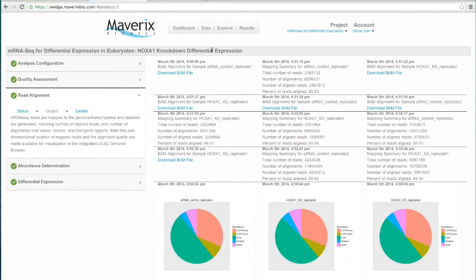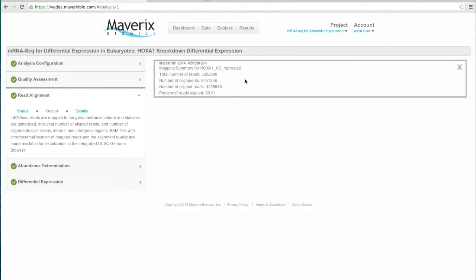If somebody wanted to do a batch download of all of that data, that's an instance where we would set up direct access for you so that you would be able to access the S3 bucket in the Amazon cloud that's behind your account and download things in bulk. You have some mapping statistics for each of your samples.